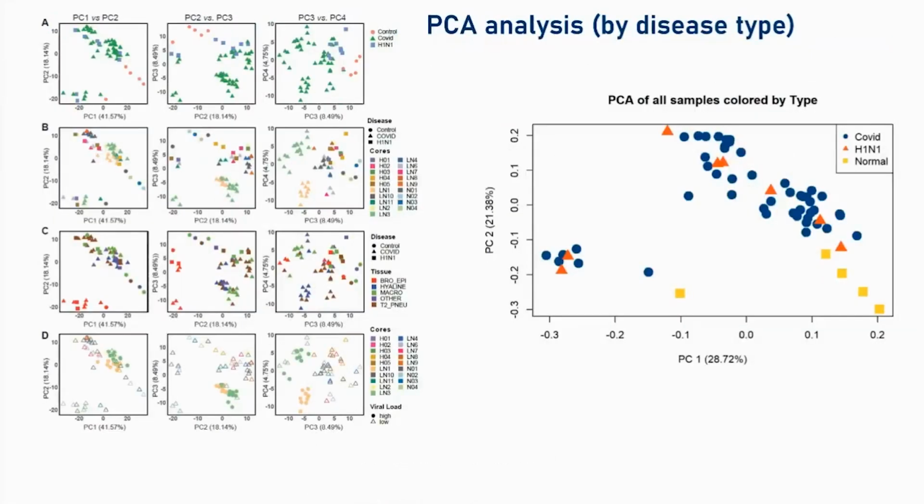And so when we look at a dimension reduction analysis, sort of a helicopter overview of the transcript data, this is at 1800-plex RNA. We can see COVID in the blue, H1N1 in the red. This is the 2009 pandemic, and yellow is the normal. And we can sort of see these two different populations. So we see this population on the right and the population on the left. At the transcript level, we can't really make out what this is.